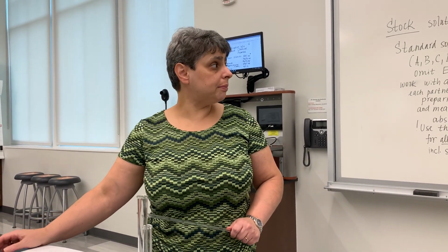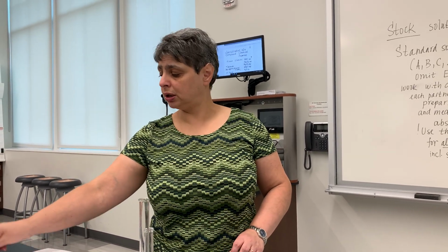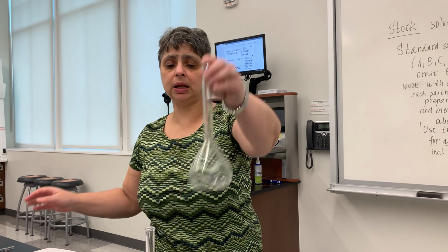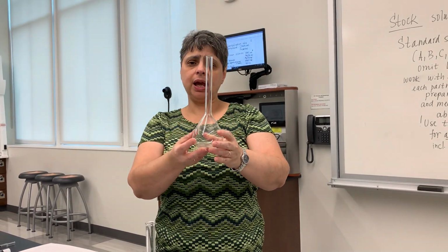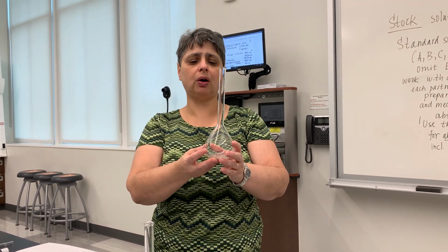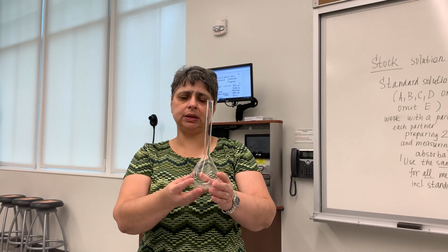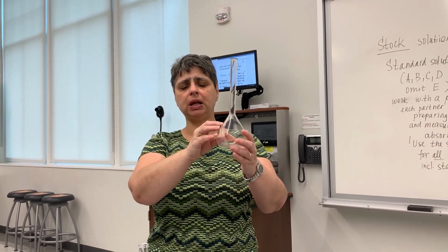One last comment I'd like to make is about when you make your solution in this flask for the tablet. The complication is that the tablet is a mixture of several ingredients, and so when you heat the tablet with NaOH and then pour the solution in here, that solution may not be colorless.